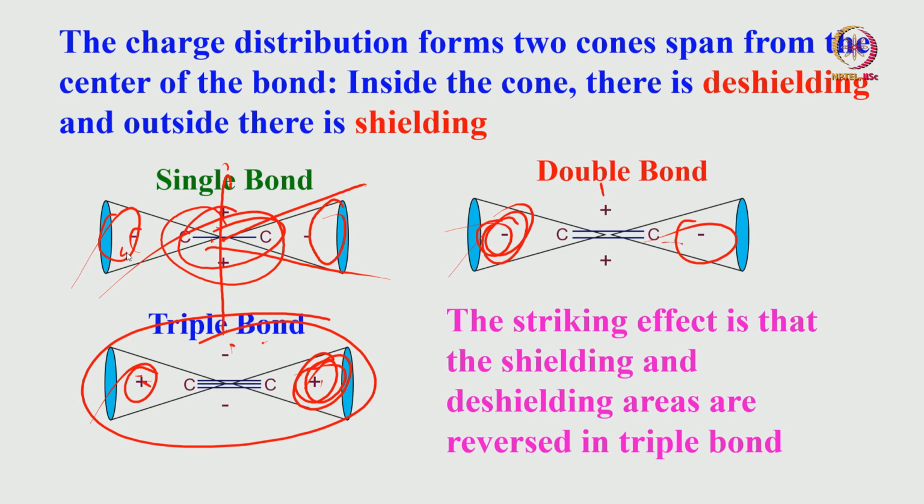So many factors contribute to chemical shifts. By experience you should know what are the factors which are contributing in a given molecule, and we can start interpreting and analyzing the spectrum. So this is all about chemical shift.